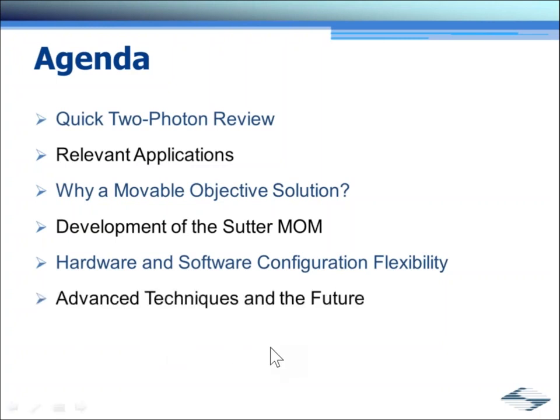And finally, we'll finish up with a discussion about advanced techniques and the future of movable objective microscopy.